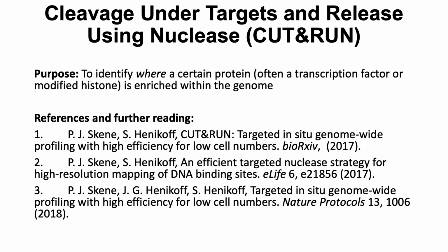CUT&RUN is an enzyme-based approach used to identify genomic locations of transcription factors or histone modifications. This technique was developed in the laboratory of Dr. Stephen Henikoff and is first described in the publications listed here.